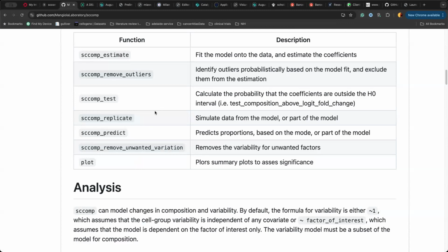You have so many genes that maybe you don't really care about each one of them. But for cell types, that's not the case. So you might have 20, 30 cell types, and sometimes rare cell types, NK cells or Tregs, are very, very important talking about the immune system, for example, very important for disease. So you really want to model rare cell types too. That's why a count distribution is needed. If you pretend these are observed proportions, then for rare cell types, you would not be able to model the uncertainty of that proportion. So a count distribution is very much needed here.